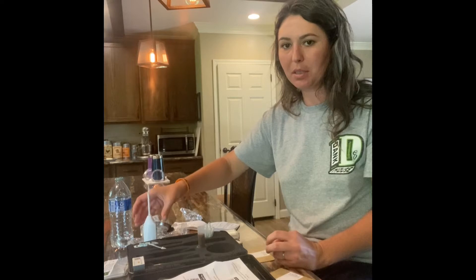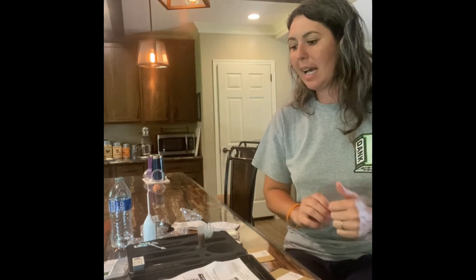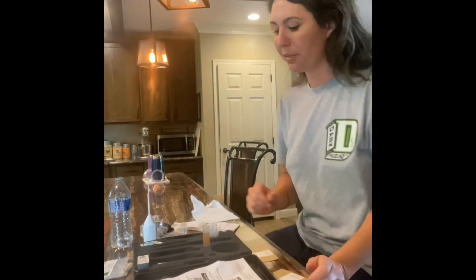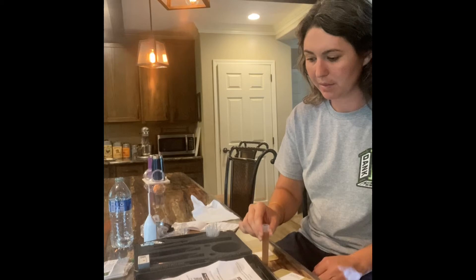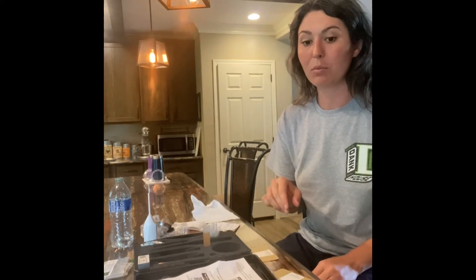Now we set a timer and let it sit for 5 minutes, then tap it down and let it sit for another 15 minutes. Our first 5-minute timer went off, so we're just going to take it and slowly tap it. Now we're going to go for 15 more minutes before we take our sample.